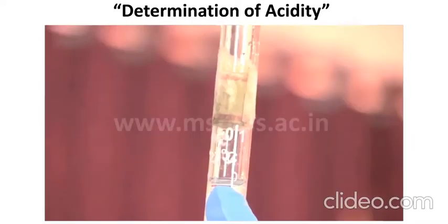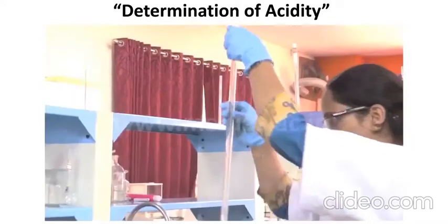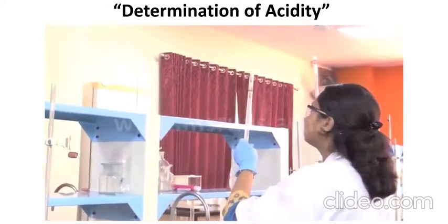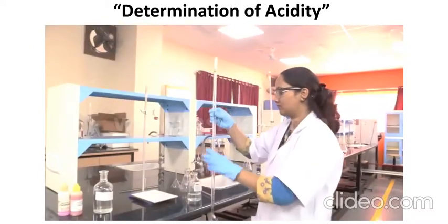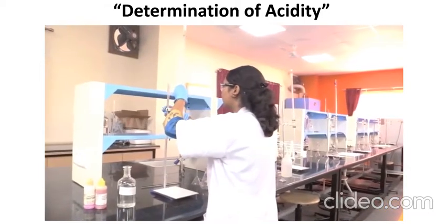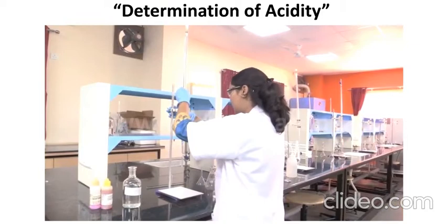Adjust the quantity to 0. Place the buret in the buret stand.